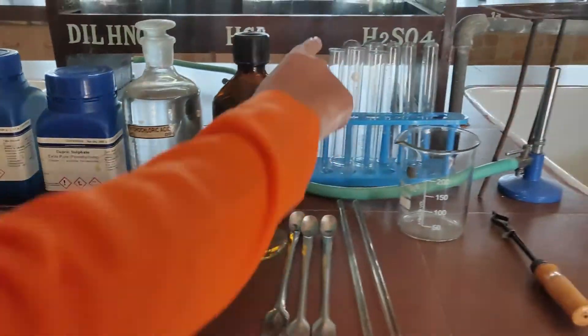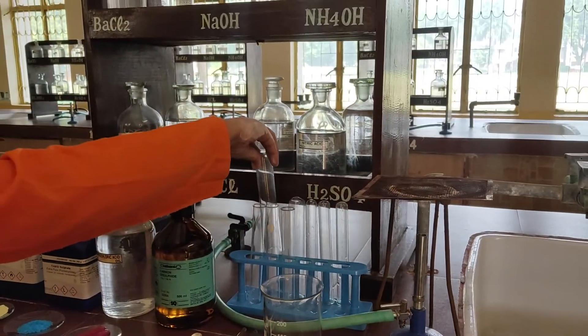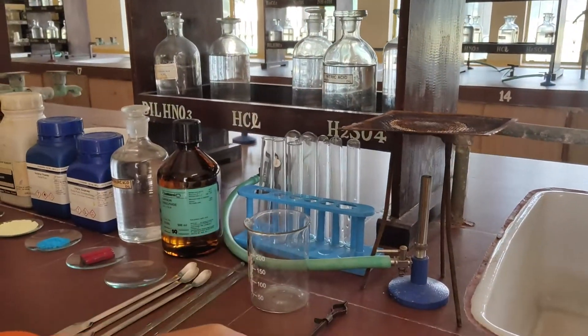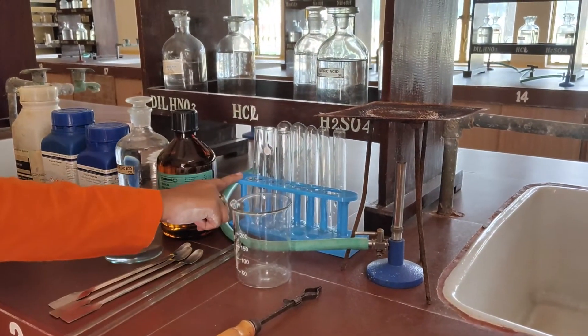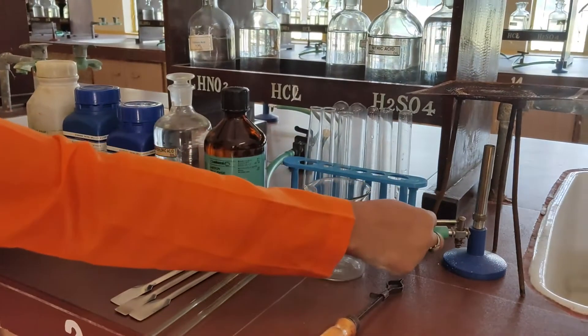Now let us see the apparatus. This is a test tube. This is a boiling tube. Next is a beaker, test tube holder, test tube stand, and tripod stand with a Bunsen burner in it.